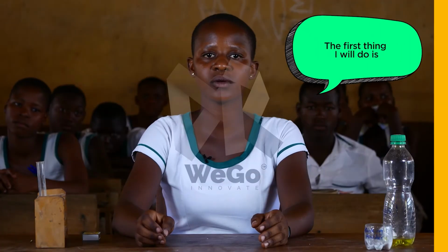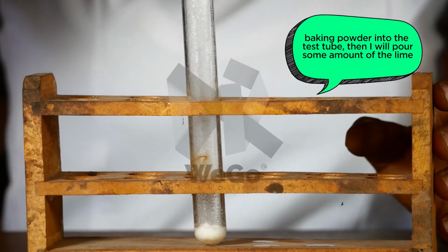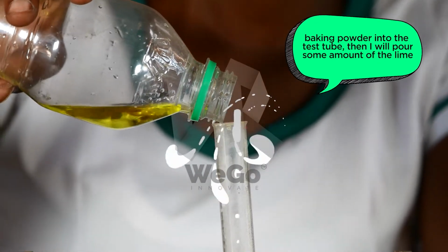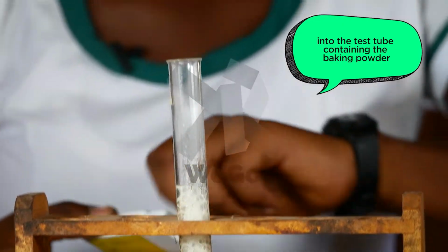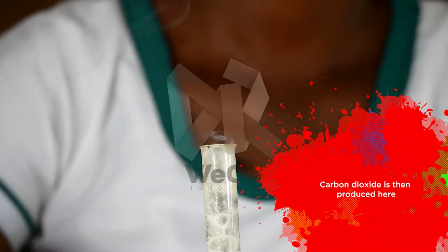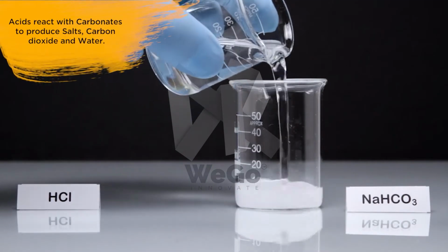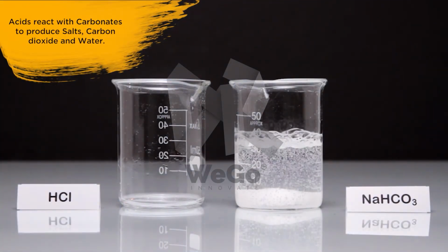The first thing I will do is I will put some quantity of baking powder into the test tube. Then I'll pour some amount of the lime into the test tube containing the baking powder. Carbon dioxide is then produced here. Acids react with carbonates to produce salts, carbon dioxide, and water.